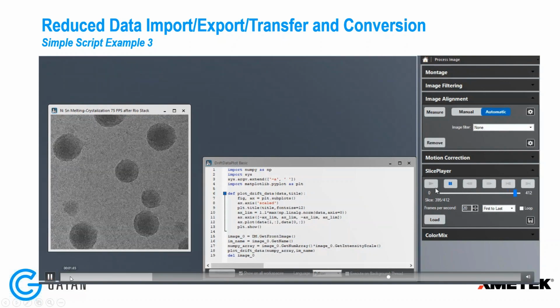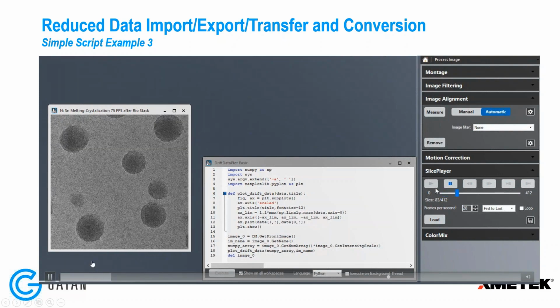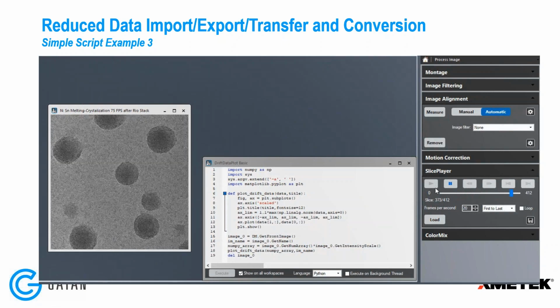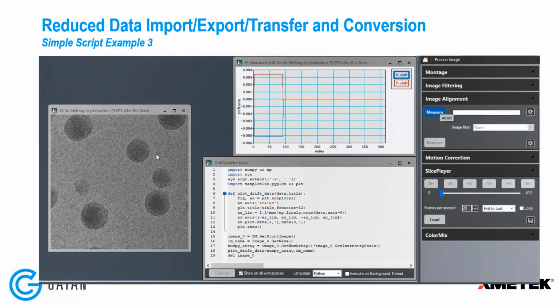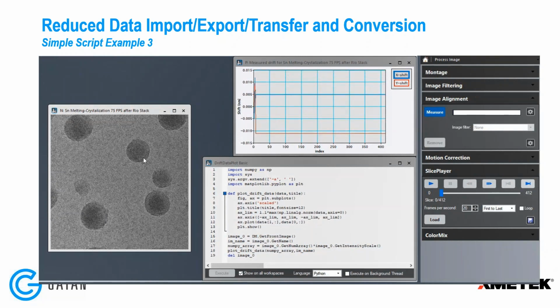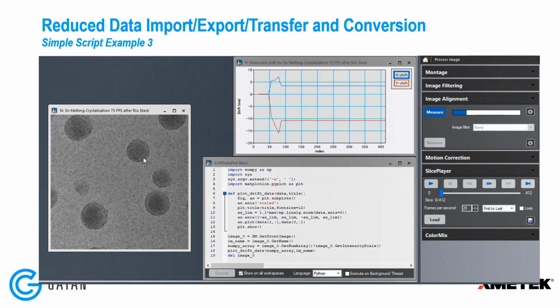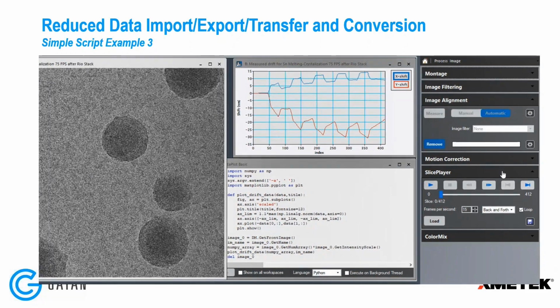And so you can see it drift back and forth. Play that again. Drift back and forth as the sample is heated and cooled. And so I want to measure that drift and remove that drift from the data set for my experiment. But then my Python code is going to take this nice drift plot that we get in GMS and plot it in a slightly different way.